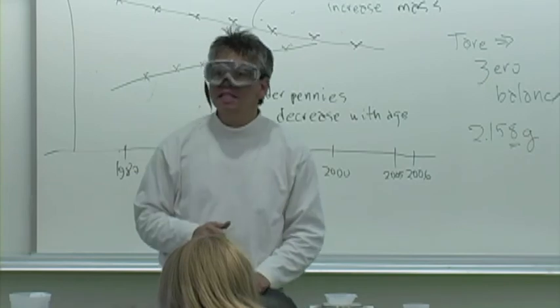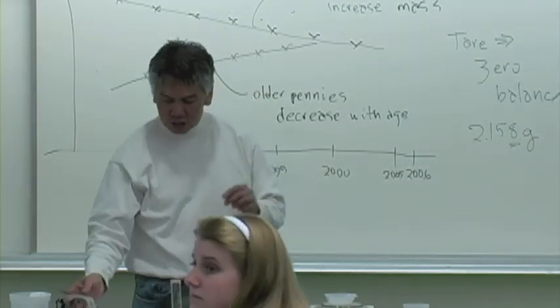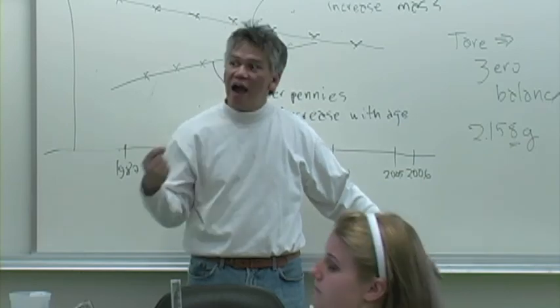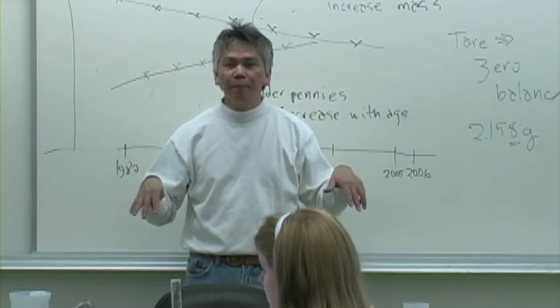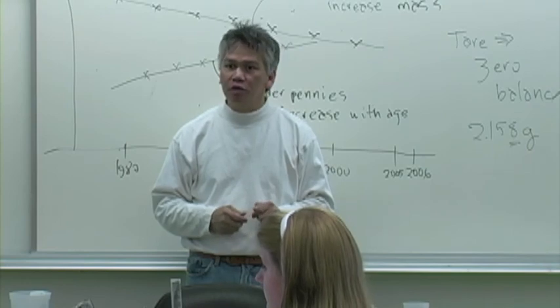So you're going to do this 10 times. Okay? Work with your partner in doing that. Once you get the mass, as soon as you get the mass in the ear, come up to the board, and we're going to do a graph on your results. And then we're going to stop for about 15 minutes, talk about it, and then we're going to move on to part 2.